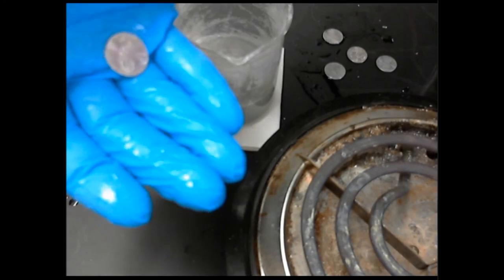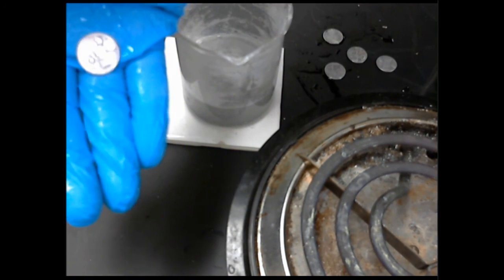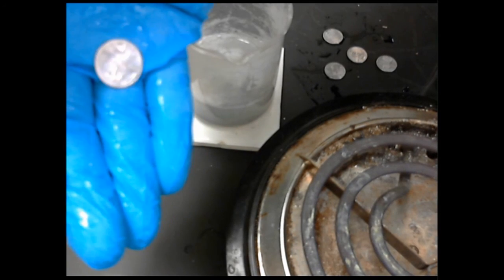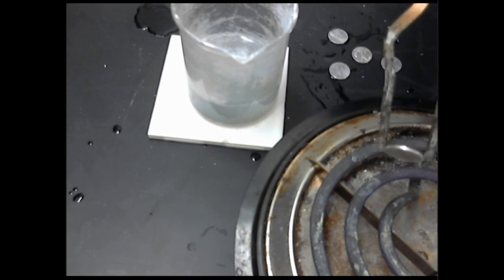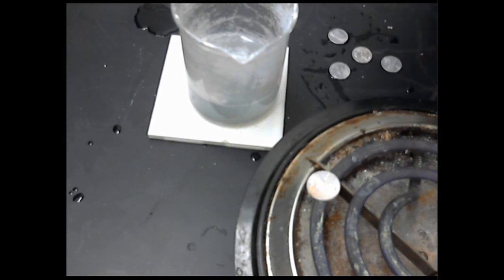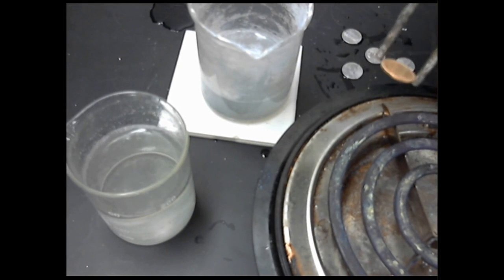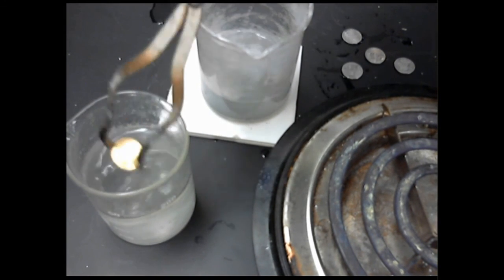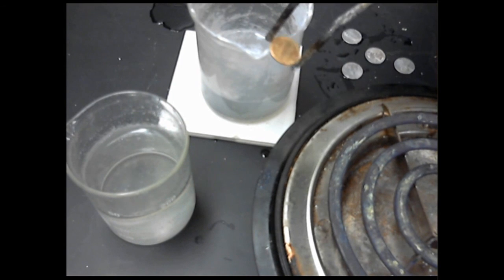And there we have it. These pennies have been completely coated in zinc, so they have this nice, shiny, silvery color. They are just vibrant, shiny silver. You can leave them this shiny silver color if you like, or you can put them back on the hot plate for a minute and watch very carefully to see the moment that they completely change color. The moment they change that coppery color, you need to take them off the hot plate and douse them in a container of cooling water, and then you should see that they change to a vibrant gold color. What you've just done is you've mixed together atoms of copper and zinc to make brass.